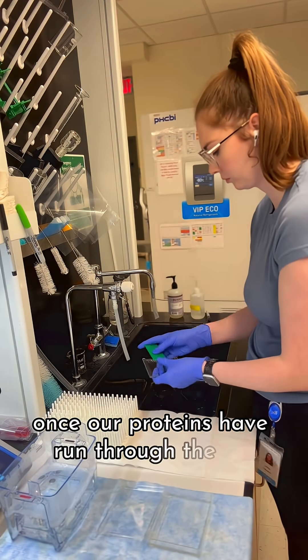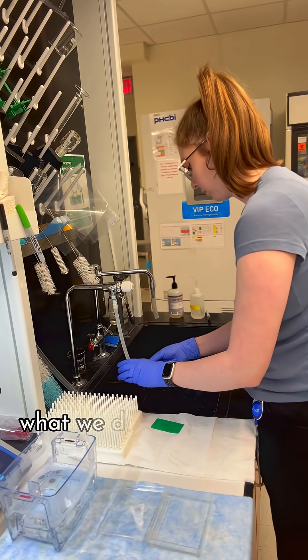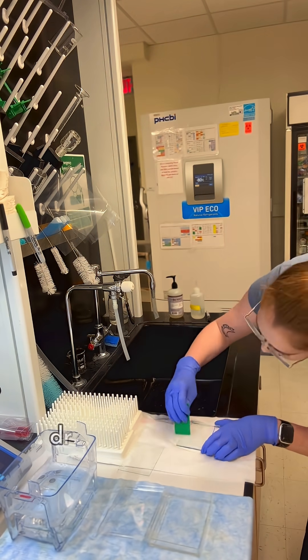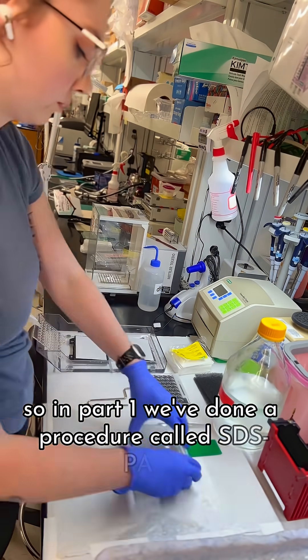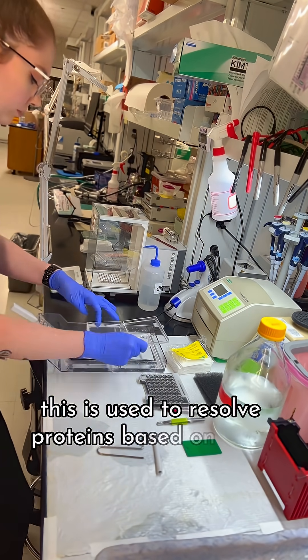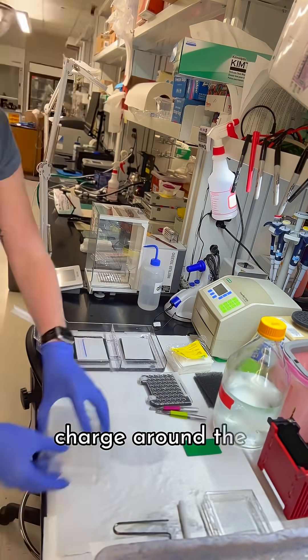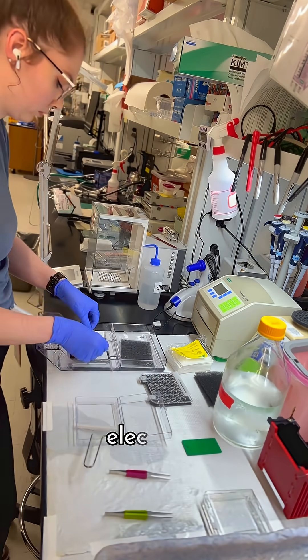Once our proteins have run through the gel, we have to transfer them onto a membrane or blot. What we do here is called a wet transfer, but there are also semi-dry transfers as well. In part one, we've done a procedure called SDS-PAGE. This is used to resolve proteins based on their weight by adding a negative charge around the denatured protein so that it can be pulled through the gel using that positive electrode.